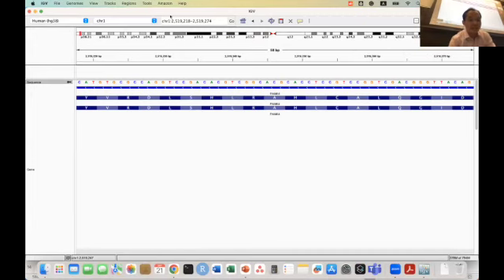And we are looking at the really beginning part of the P arm. Do you see that everything starts with P in this section? And if you go to the right side, everything starts with a Q. That's our P and Q arm. And you have a band. When you dye it, yeah, we have the dyeing band designation. So if you want to know some more detail on that, you can just click to see it. Right?